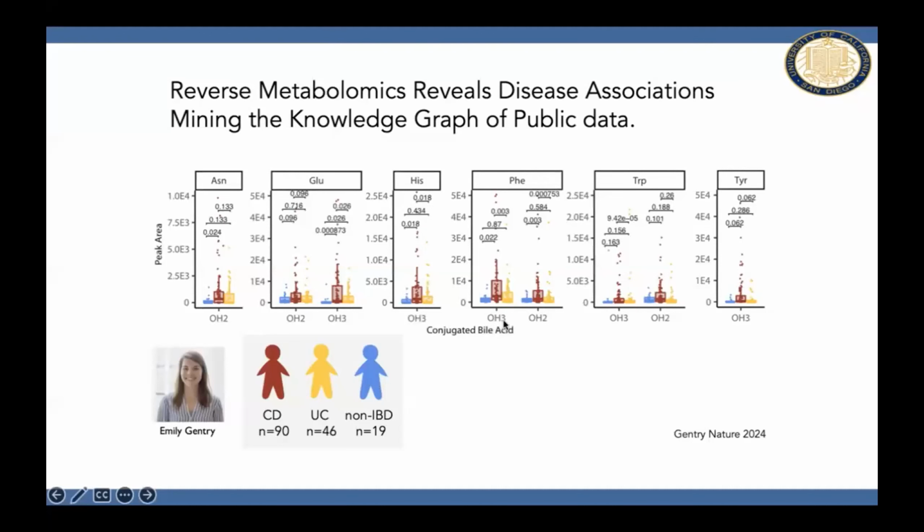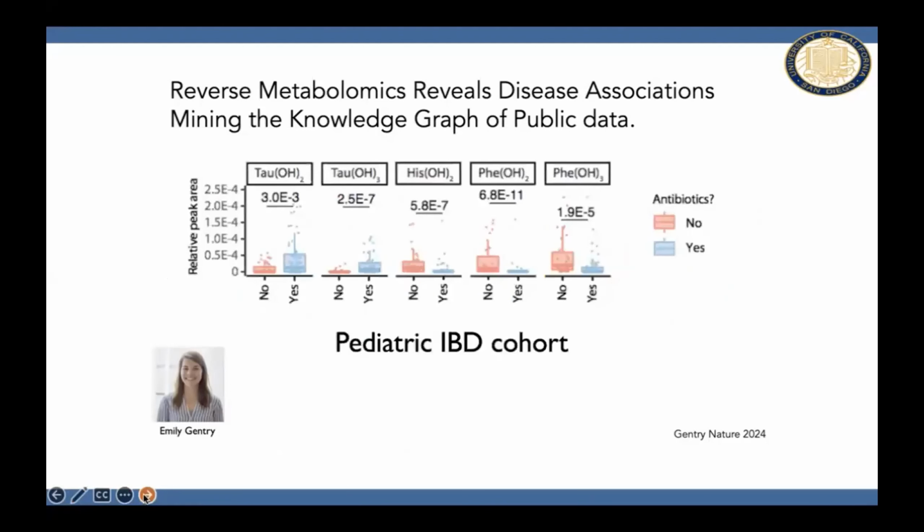Now, I should note that we highlight that this is a trihydroxylated, dihydroxylated phenylalanine conjugate, for example. The reason why we are not able to say that this is a cholic acid or a muricholic acid is because the fragmentation patterns are really hard to differentiate. And so at the repository scale search, we cannot yet differentiate, although I do think that is coming soon.